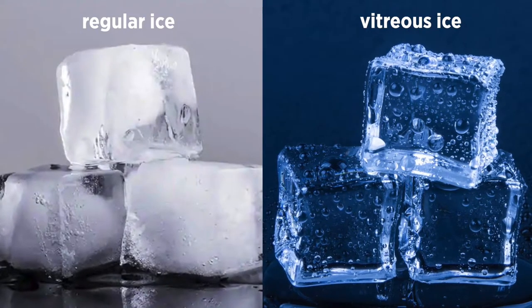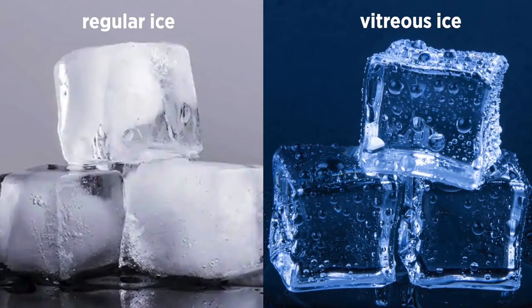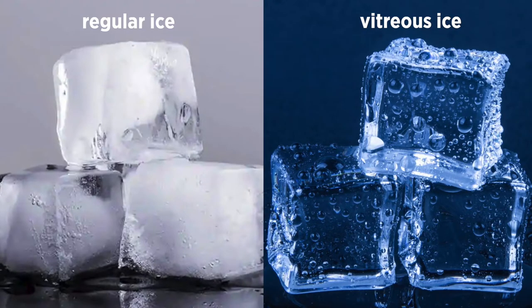Vitreous means glassy, and so what we're doing is we're trying to freeze samples so fast that they just form a glassy ice. It means that it doesn't have any crystalline structure to it.